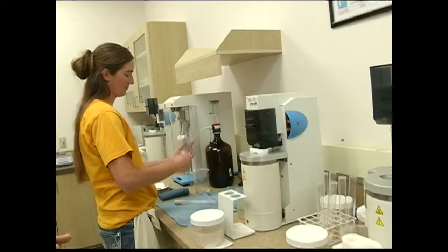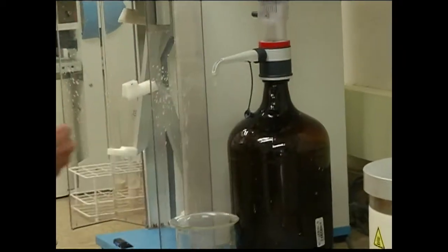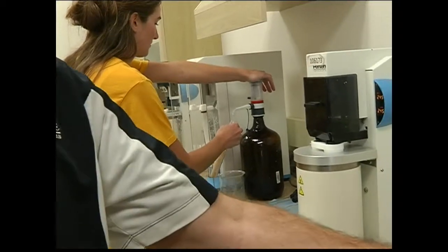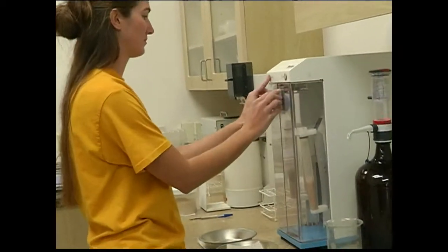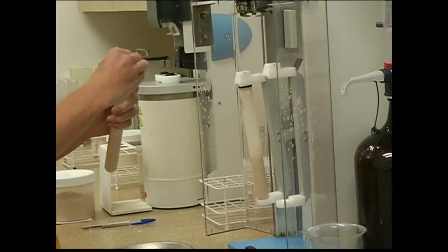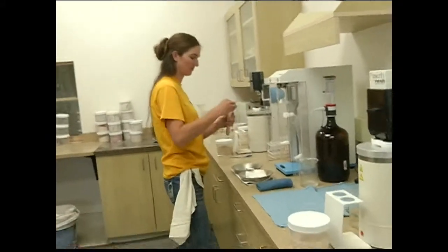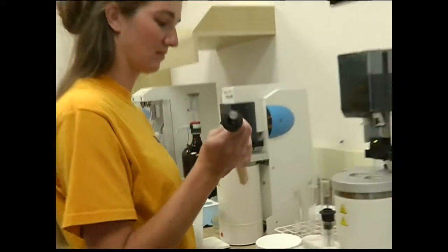So what we're going to do is mix together 7 grams of flour that we've weighed out with 25 mils of distilled water and put that in our shaking machine. We're essentially making a slurry of water and flour, and we're going to add that to our hot water bath. So essentially we're making a little glob of thick gravy. If the wheat is sound and undamaged, that little blob of dough will remain stiff. If the wheat is damaged and the enzyme activity is present, that little blob of dough will be converted from starch into sugar, so it'll be very thin. And that's what this test measures, the viscosity of that dough, or the thickness of that dough.